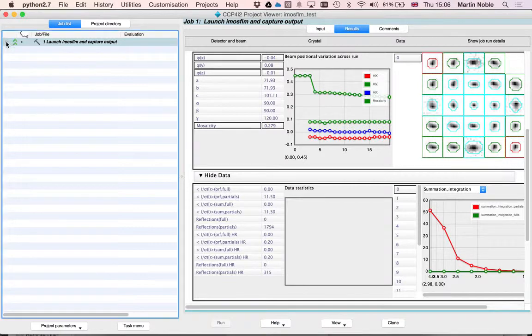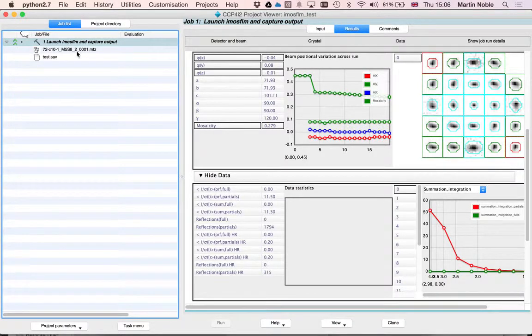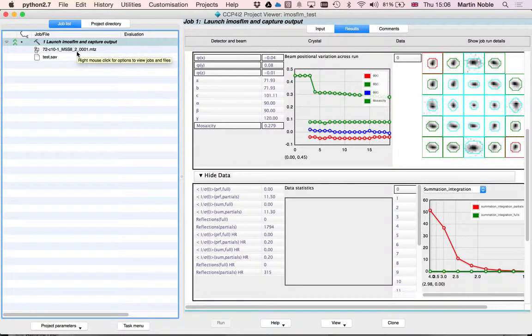What this has captured into the database for us is two things. First of all, it's captured the .mtz file that came out of that. That's something that you can put straight into Phil's data reduction pipeline.